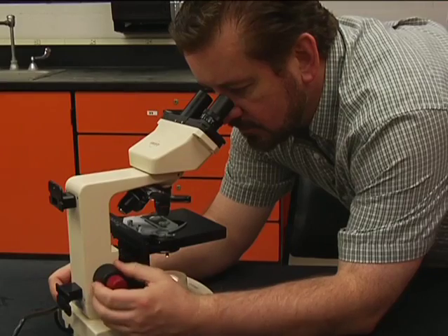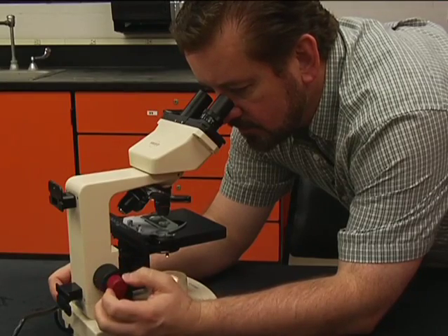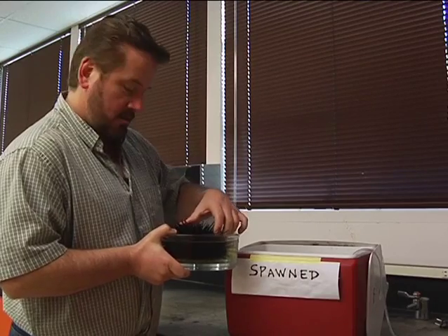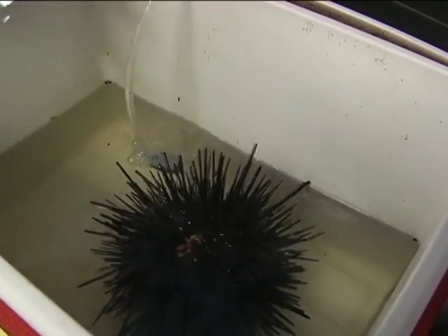Over the course of the lab period, observe the sample of fertilized eggs that your instructor has prepared. After you've collected the gametes, put the used urchin in the appropriately marked container. This prevents the unused urchins from spawning prematurely.